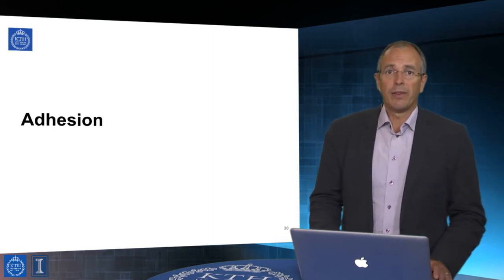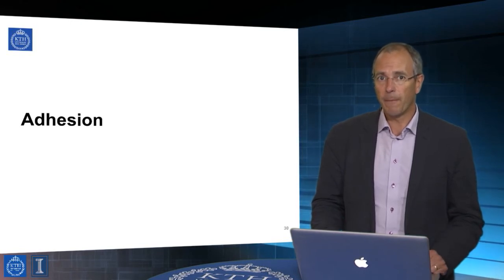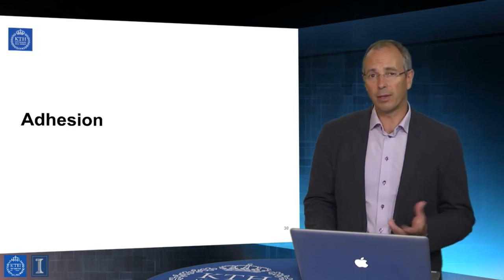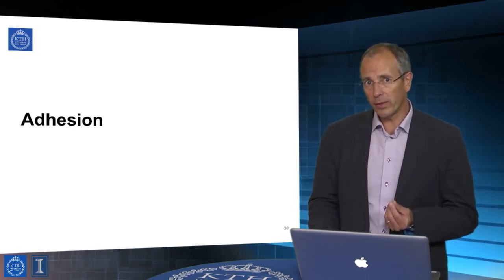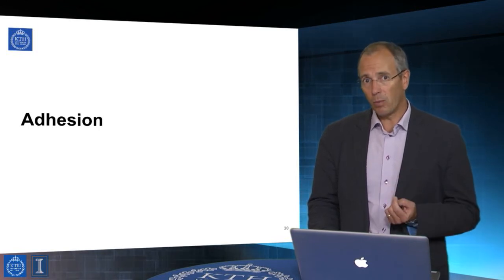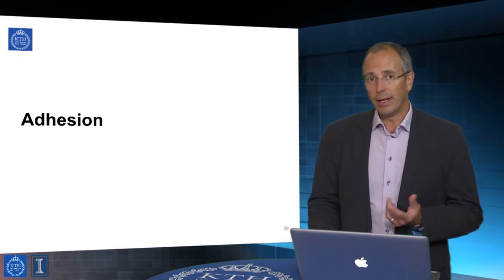All right, so the other thing we have is the adhesion. That's a very characteristic measure of the interaction between a tip and a surface. We should be a little bit careful if we're working in air, because as I mentioned in an earlier lecture, you can get water condensation around the tip in contact with the surface, and the presence of that water is also going to affect the adhesion. So in some cases, you completely lose adhesional contrast as a result of the fact that your contact is always the same, because it's determined by the water film rather than the material properties.